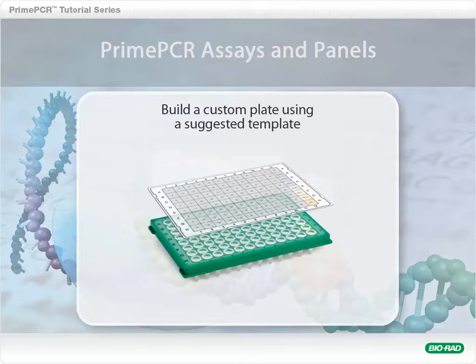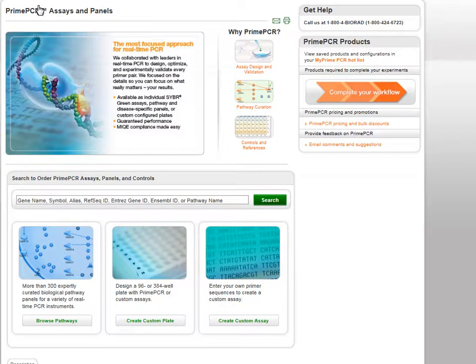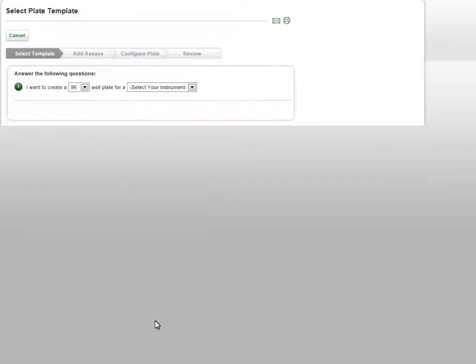Welcome to the PrimePCR Assays and Panels Web Tutorial. From the PrimePCR homepage, click on the Create a Custom Plate button in the center of the screen to launch the Custom Plate Configurator.